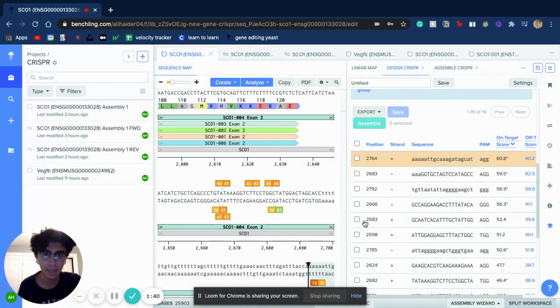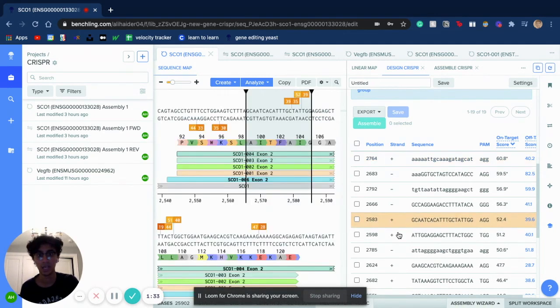The best sequence that I was able to find is in the position 2583. Here you can see that it touched on the transcripts. If we were to use this for a single guide RNA, and then later on use it in CRISPR, it would actually affect the transcripts, meaning that it's going to affect how this appears as protein.